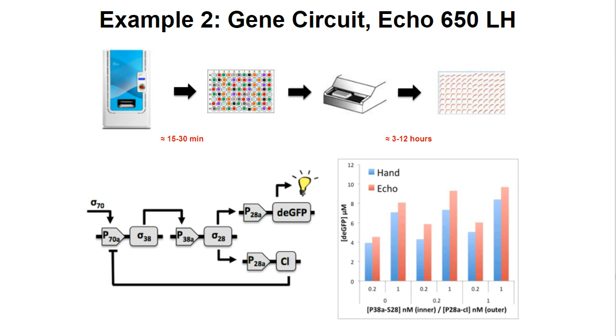So in this case, I wanted to look at a negative feedback loop. So here you can see there's 4 genes. If you consider having 4 genes in a circuit, that means that you have to make sure that the concentrations of these 4 genes are correct for the circuit to work. And so with 4 genes, for each gene, you have to change the concentration and see how it would work with the other ones. So that's a lot of complexity. And if we study even bigger circuits that have more genes, the complexity increases even more, and you have to scan the whole parameter space.